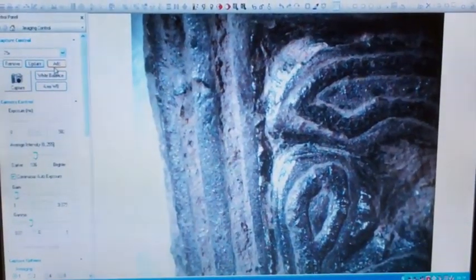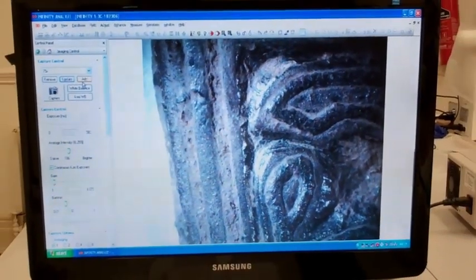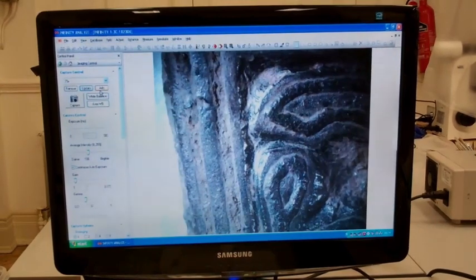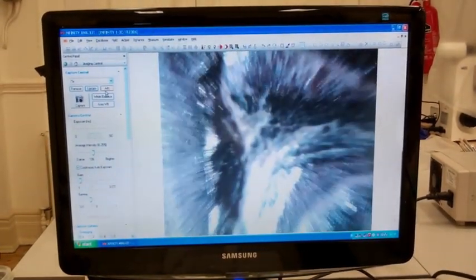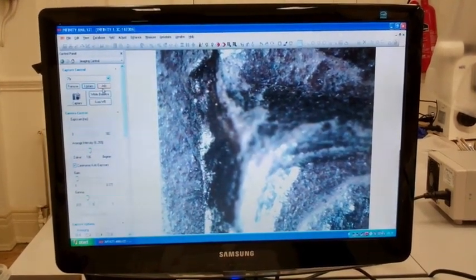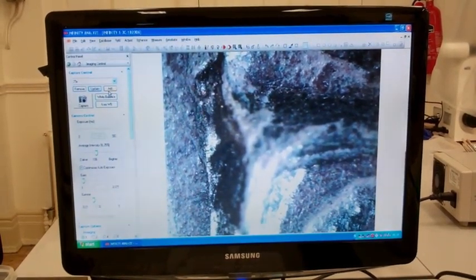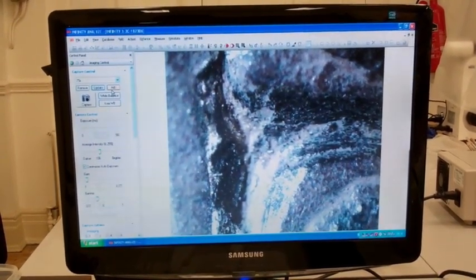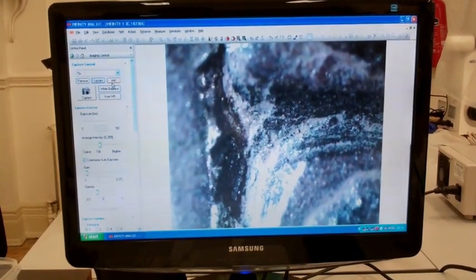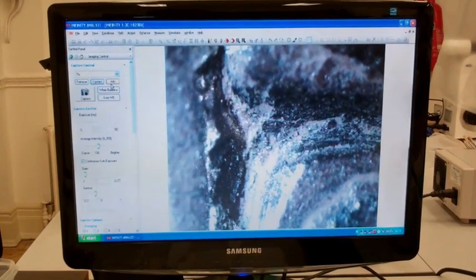This image is magnified 7.5 times, and we can see quite a bit of the object in focus. Though if we jump to a high magnification, say 75 times, the depth of field — the area that can be focused — is in a very narrow range, making it very difficult to focus the entire image. Here I'm trying to take a clear photograph, and at the moment the top of the raised yellow decoration is focused, but just with a twist of the focus knob, now the bottom of the channel is in focus. This can be really frustrating for documentation of objects that seem relatively flat to the naked eye.